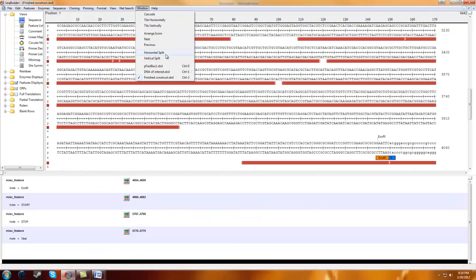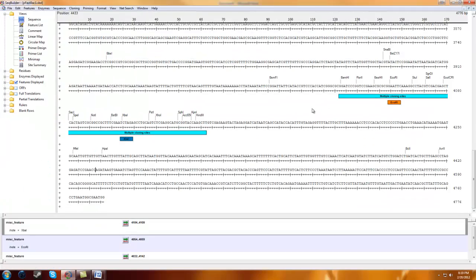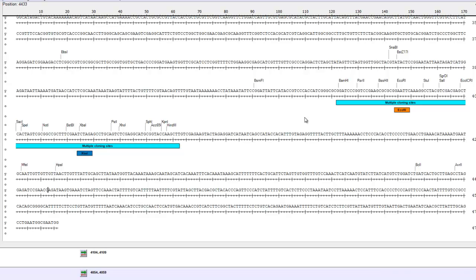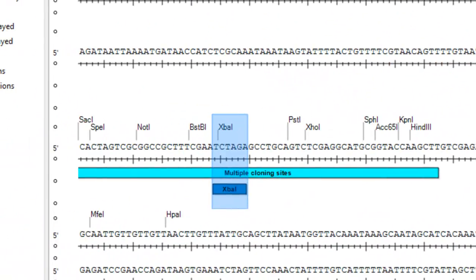I'm using the pFastBac as my cloning vector. Depending on what you use it varies, but in all cloning vectors we have multiple cloning sites, which is where we can insert the DNA we want to express. These multiple cloning sites are designated by a series of unique restriction enzyme sites. Today I'm going to be cloning into the EcoRI site and the XbaI site.